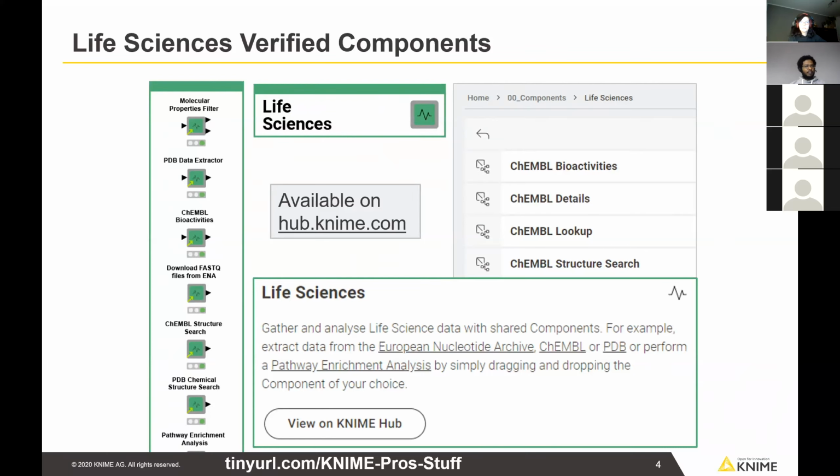Also, you can search them on the KNIME Hub. We decided on this icon for all our life science verified components, and the color is also green for the life science components.